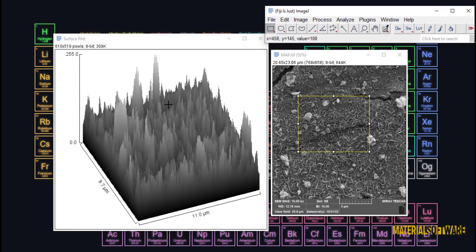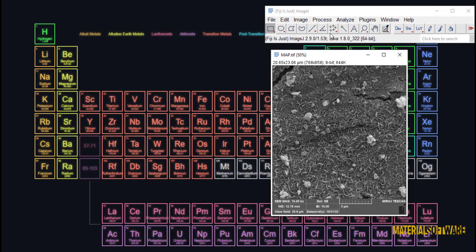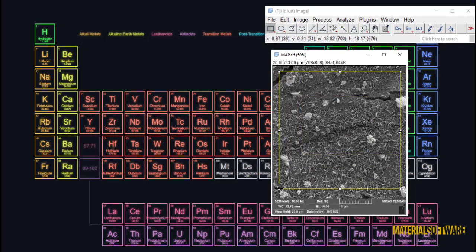Now, in order to check the quality of roughness in SEM images, we first make the image 8-bit. Then using the rectangle tool, we select the part we want to check the roughness.